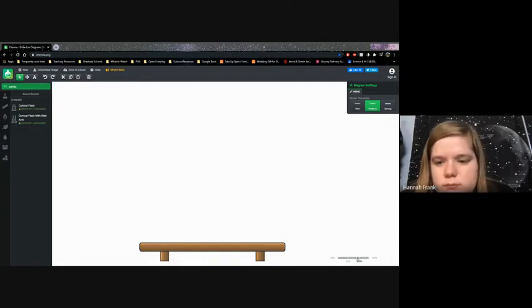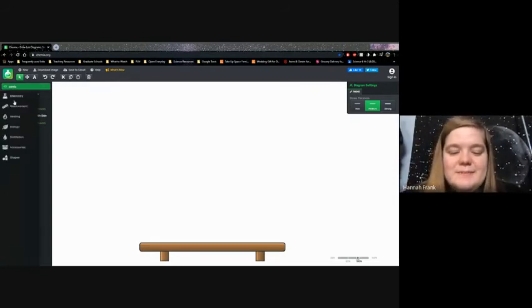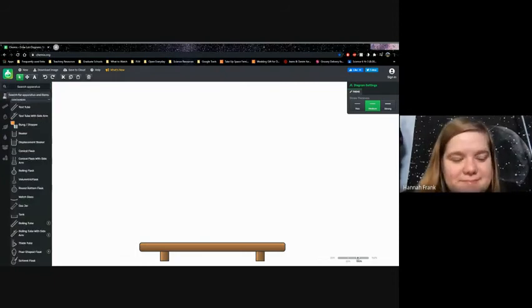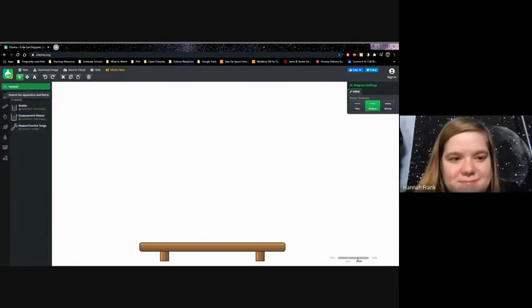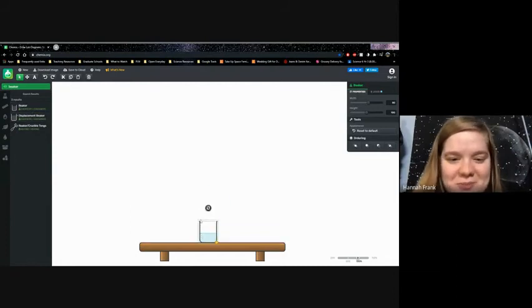Yeah, solid choice. I've only done TLC once. You've only done it once? Oh, really? Okay. Well, there is a picture exactly on the doc. Okay, I need a beaker. And if I had known you'd only done it once, I wouldn't have made you do this one. I'm sorry. No, you're fine.